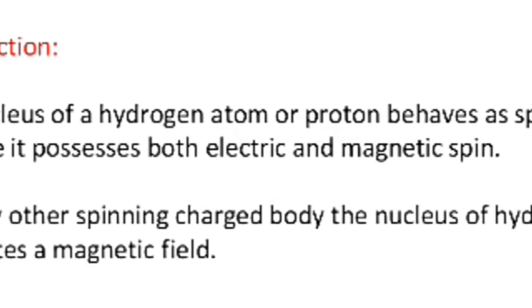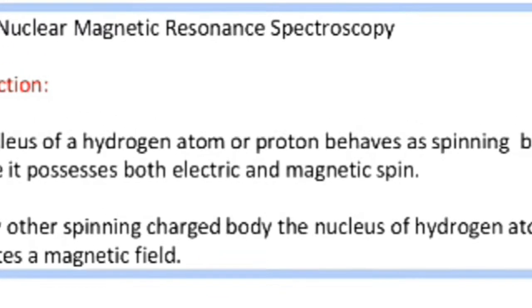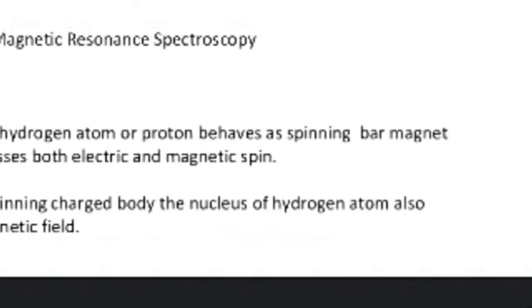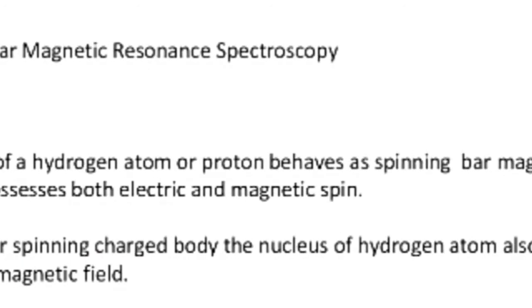If we take a spin magnet or spinning bar, we can explain the nature of NMR spectroscopy with the bar magnet, as it possesses electric and magnetic spins.